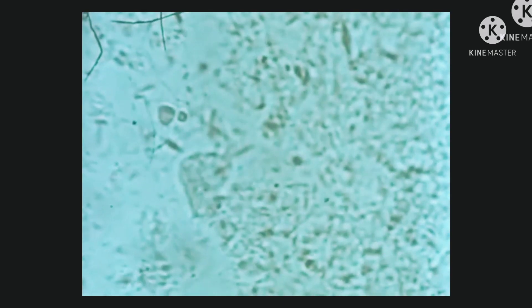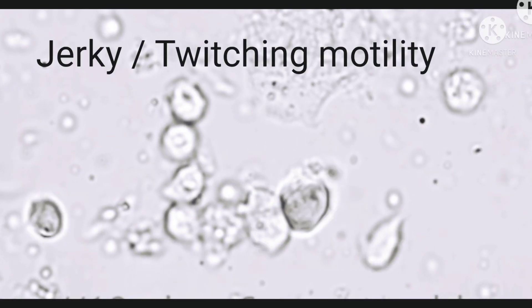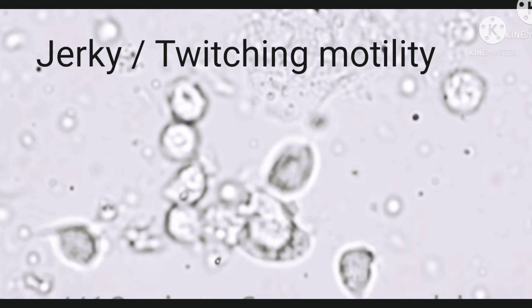Next we have sluggish movement with pseudopodia, which is seen in Entamoeba histolytica. You can see the pseudopodia being extended in different directions — the movement is sluggish and multidirectional. If you look carefully, you can see the ingested red blood cells, which is a characteristic feature to distinguish Entamoeba histolytica from other commensals of the gut.